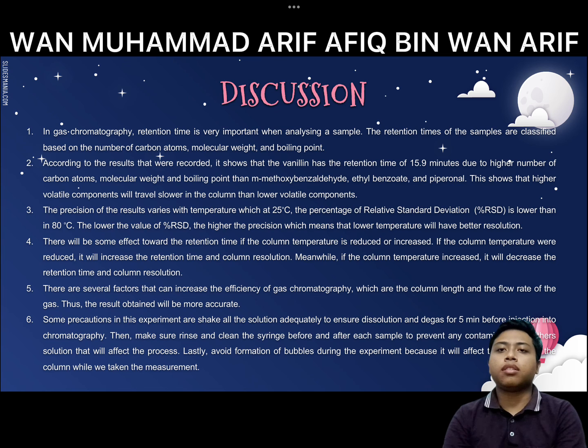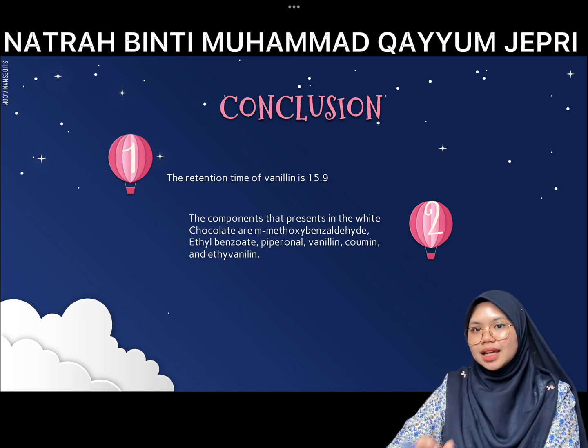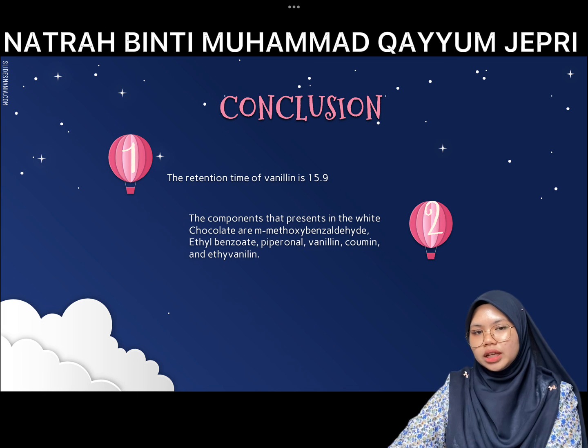In conclusion, the objectives for this experiment have been achieved. From the result, the retention time of vanillin is 15.9 minutes. Next, the components present in the white chocolate are m-methoxybenzaldehyde, ethyl benzoate, piperonal, vanillin, coumarin, and ethyl vanillin. This strongly shows that the experiment was successfully conducted.